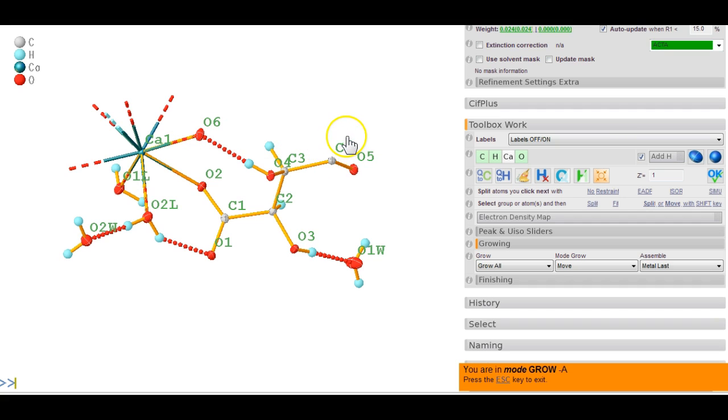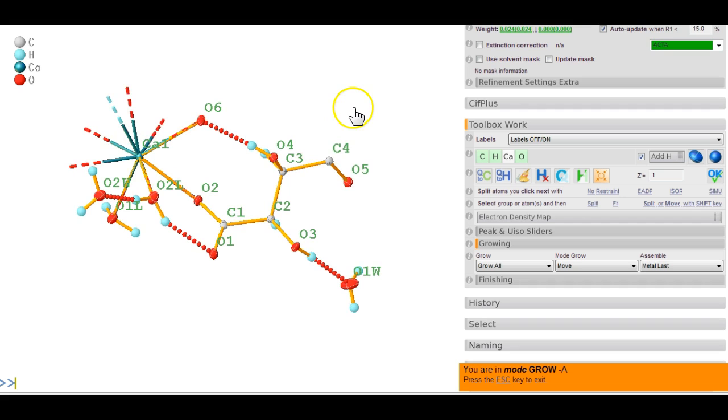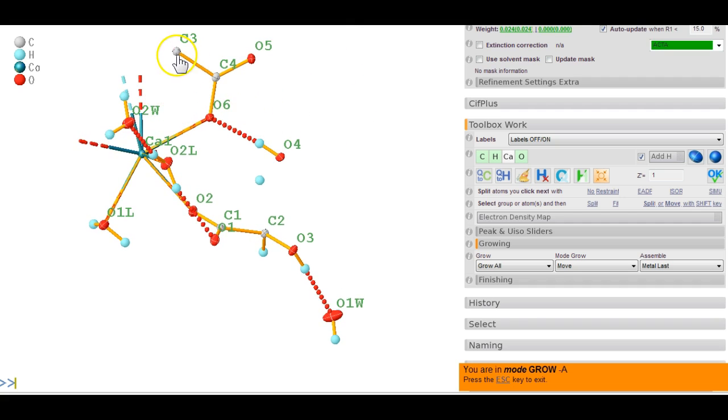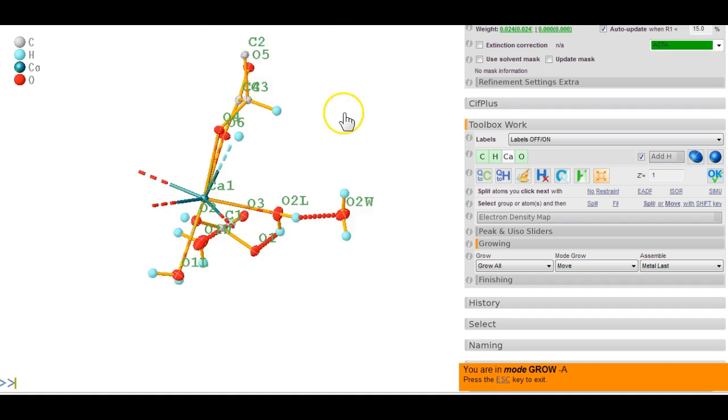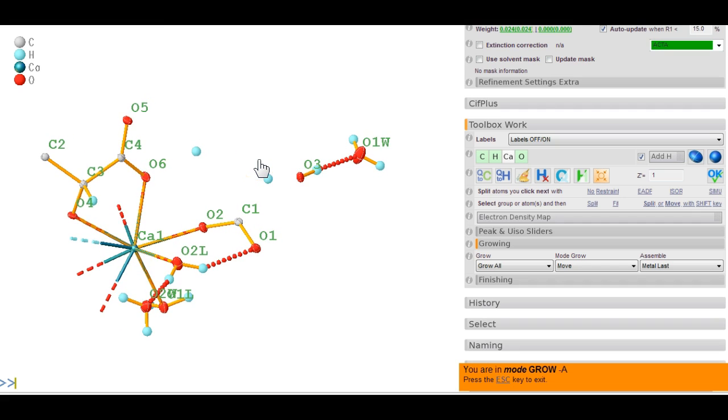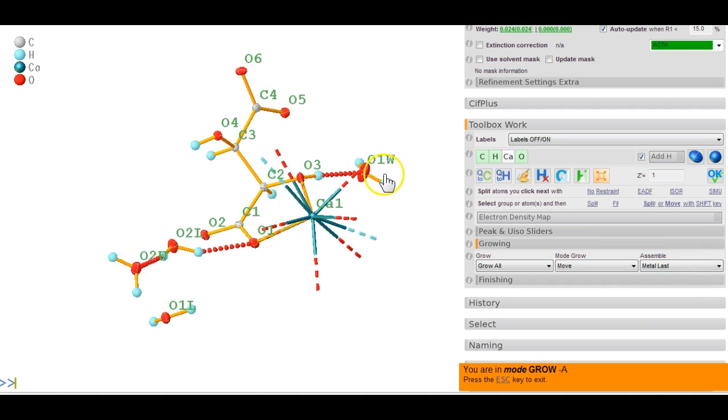This now makes more sense because this is a carboxylate here. We can continue growing this and move this whole entity over, including that hydrogen we missed. You can switch over the asymmetric unit whichever way you like. This is quite an amazing feature, because often you want to define an asymmetric unit more suitable for what you want to publish.